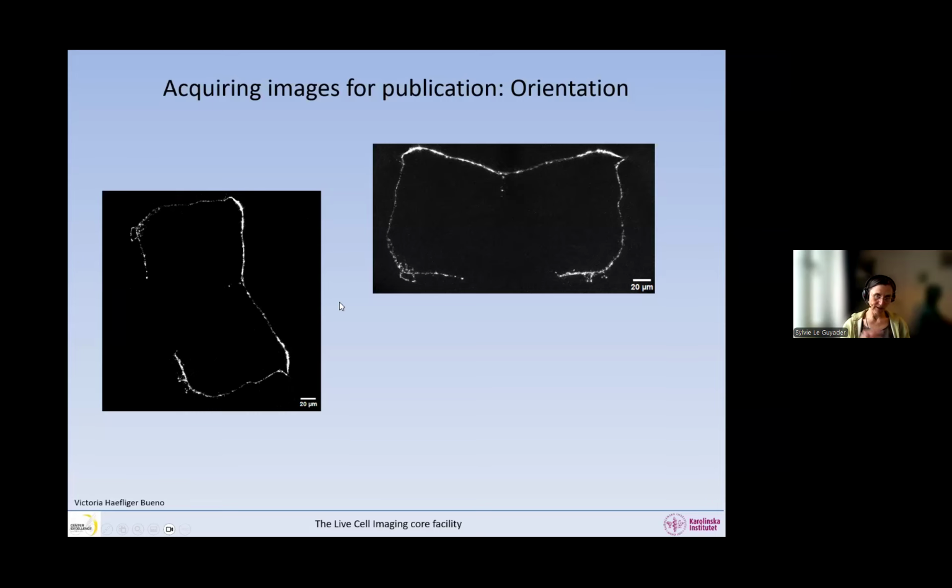Unfortunately, when we rotate the image, and I will talk about this afterwards, I think, or here, I can't remember. When we rotate an image that's already acquired, we should only rotate by a multiple of 90 degrees and not in between, so not 30 degrees or something. So clearly, if you rotate this by 90 degrees, it's going to end up like this, so it will anyway not be flat. So it is actually a very good idea to try your best in getting the correct orientation of such samples that have some sort of an orientation in themselves, like a long, thin sample. If you have a long, thin sample, you would want to orient it before you acquire the images.